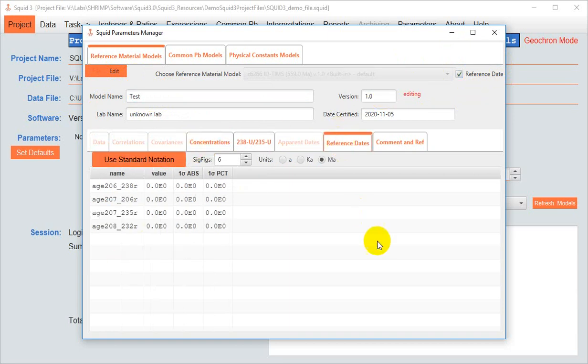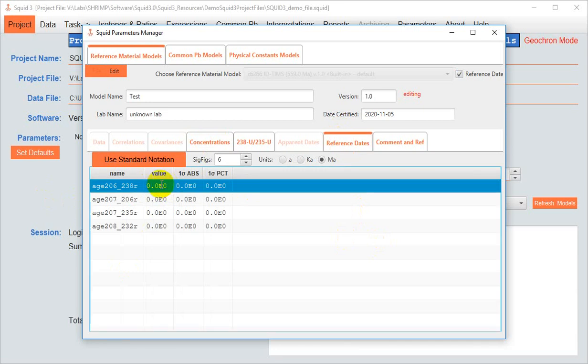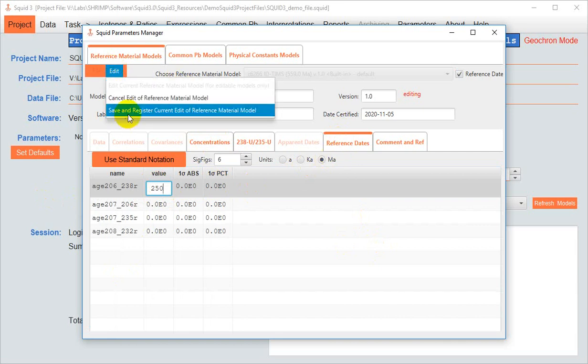In this case, we'll do reference dates, and we'll call this model, we'll say its accepted age is 250 million years. Then we can save and register the current model.